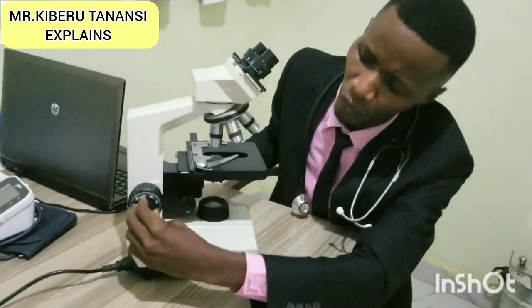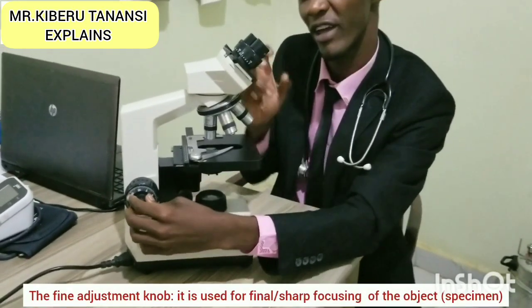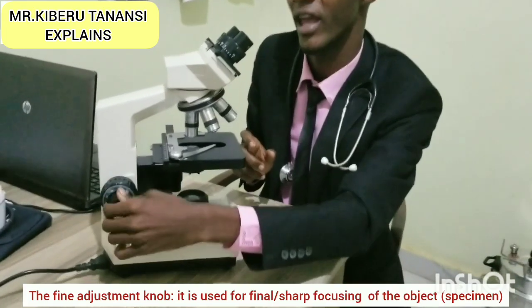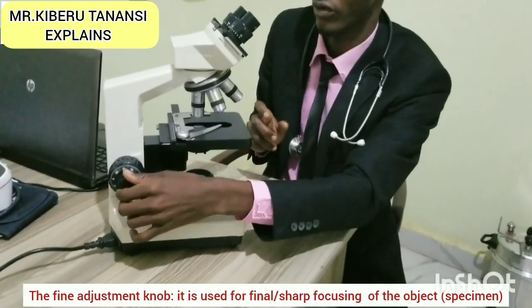Then this small one on top of the coarse, this one, is called the fine adjustment knob. Its function is for fine focusing, so that you see the image very clear. So this one is fine focusing. So we call them the fine adjustment knobs. These ones, for fine focusing, are called fine adjustment knobs.